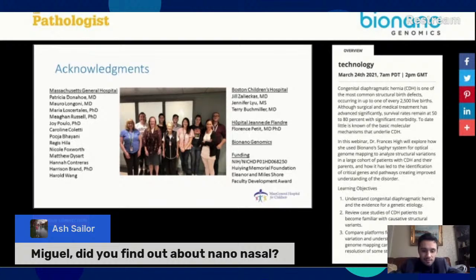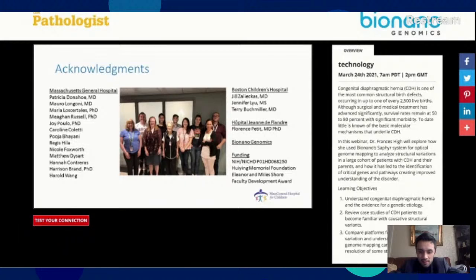Maybe I can answer that question. So for solid tissue, we require 5 milligrams of material, and that can be fresh or flash frozen. What's important here, though, is that FFPE preserved samples are just too fragmented. The DNA is too broken from this cross-linking, and it's not suitable for this analysis. But for solid tissue, we require 5 milligrams. For blood samples or bone marrow, less than 650 microliters.